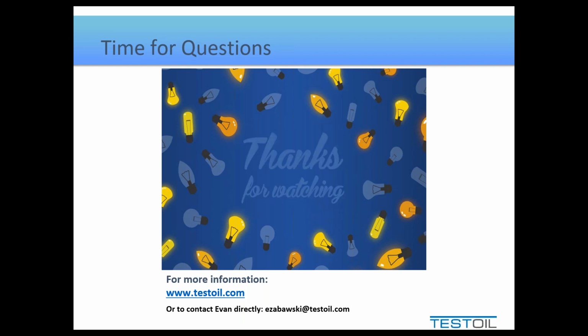And the next question we have is, is wear always considered abnormal at 30 micron sizes, considering the different clearance sizes of machine components? Well, that's where the limitation to ICP is not too much of an issue, because if you look into literature and ask what the typical clearance of a dynamic moving part is, I know two quotes off the top of my head. One says it's in the 1 to 5 micron range. The other says it's in the 2 to 22 micron range. So there's a lot of overlap in that 0 to 5 micron range of capturing most of the particles that would be generated in most of the clearances.